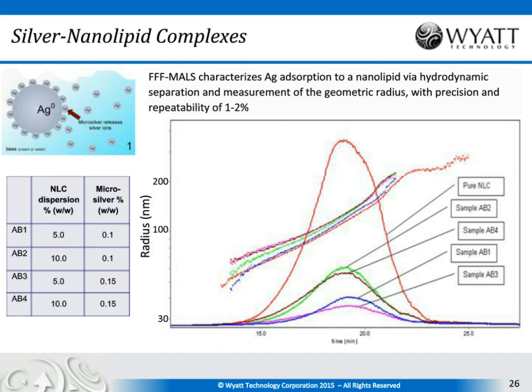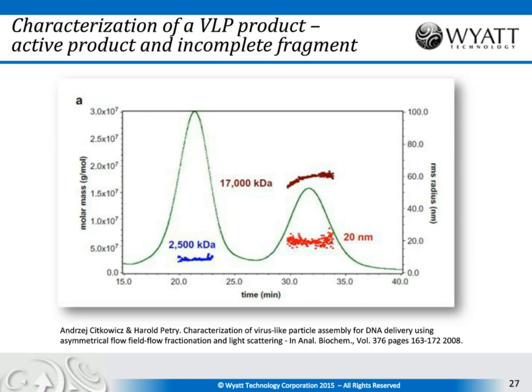This is an example of a virus-like particle. In the course of its processing and preparation, there was in solution a mixture of well-formed virus-like particles and some loose products or subproducts, and these were nicely separated on FFF. You could obtain both the molar mass and the size.